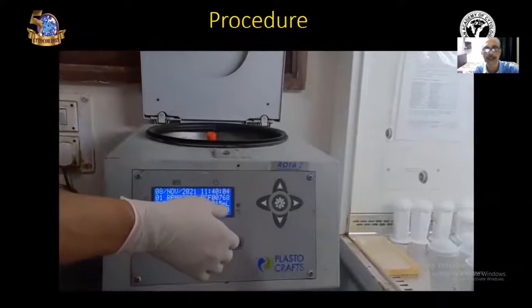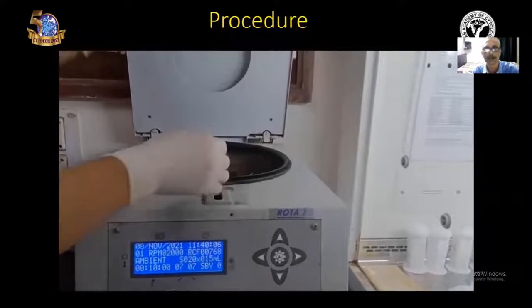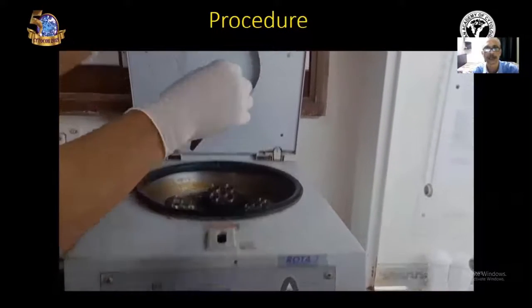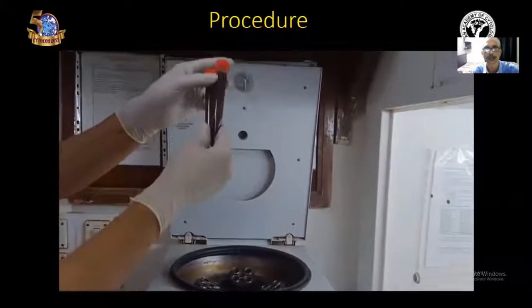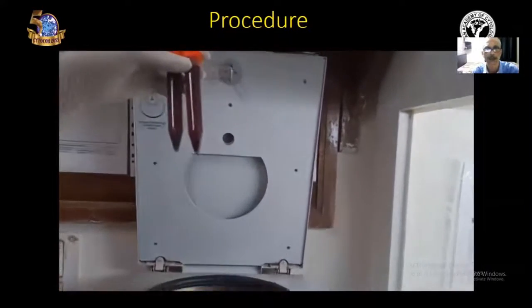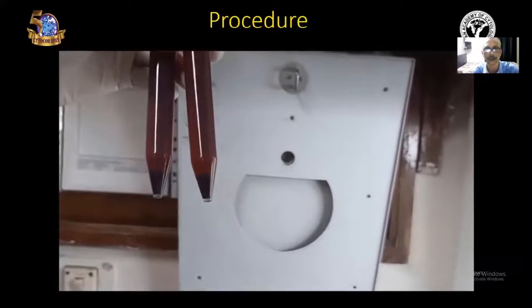At the end of 10 minutes run, take out the sample from the centrifuge, and see the sediment is already separated from the supernatant.